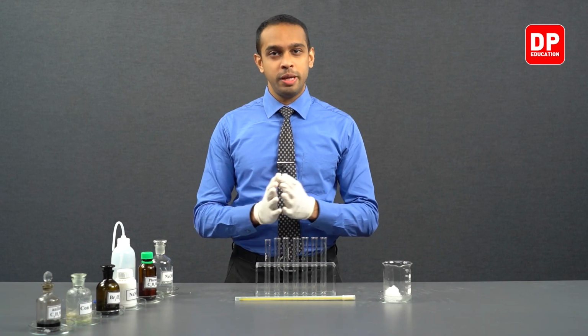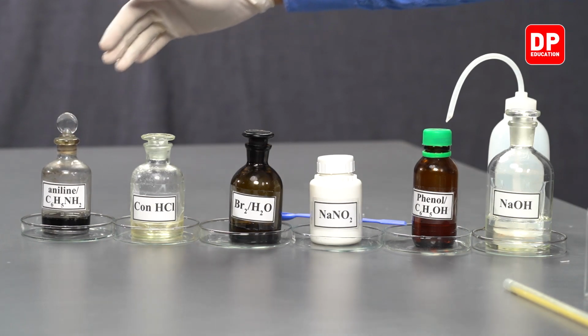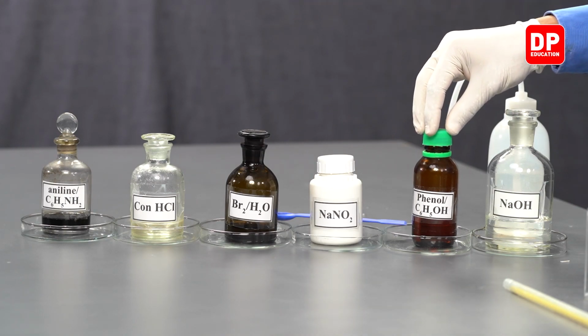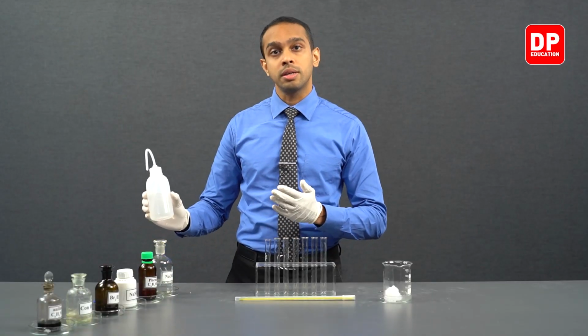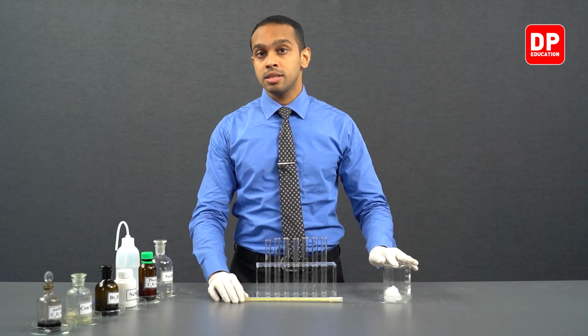Now, let's go ahead and identify the reagents and the equipment we will be using for this practical. In this practical, we will be using aniline, also known as benzenamine or phenylamine. We will be using concentrated HCl acid, bromine water, sodium nitrite, phenol, sodium hydroxide. We will be using a wash bottle containing distilled water, test tubes, a thermometer to measure the temperature, and some ice.